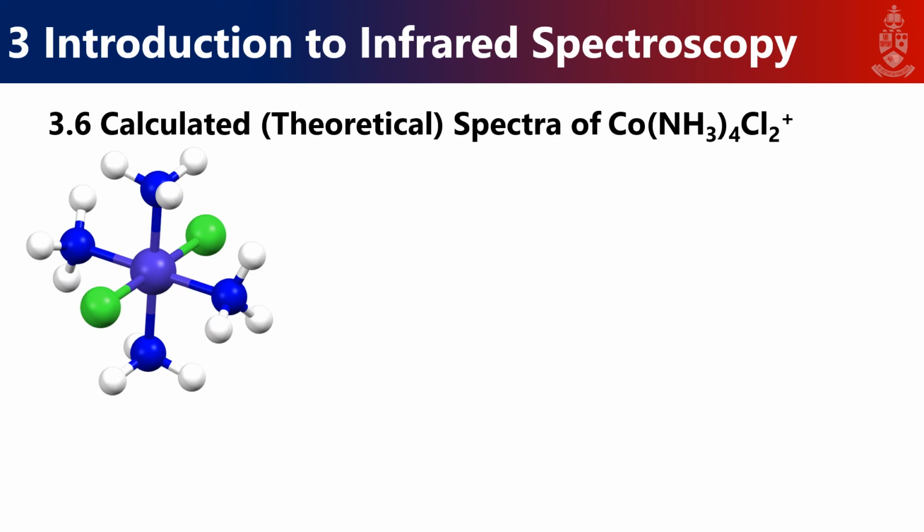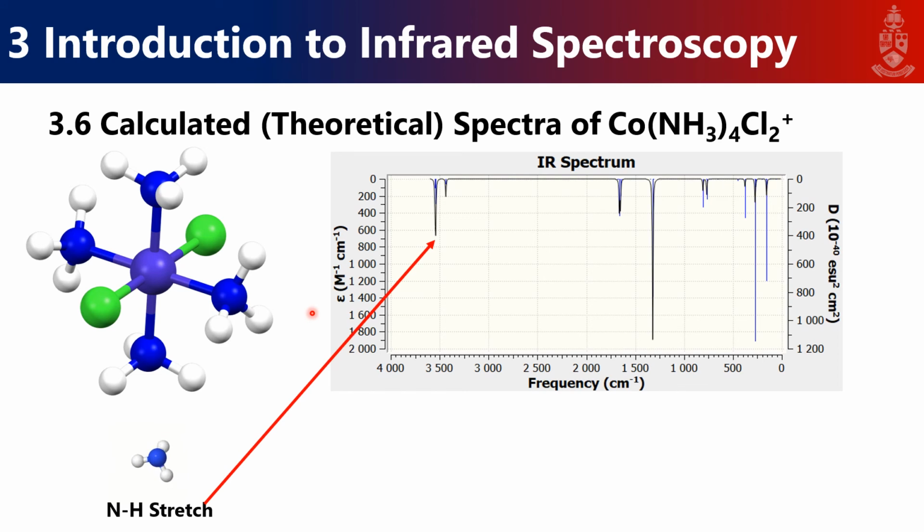So, firstly, if you don't have 6 of these bending or stretching, you should expect your peak signal to decrease, right? Essentially, we still have the amine stretch, and the bend is still present, but we have considerably less. So, in other words, that's the effect of the substitution.